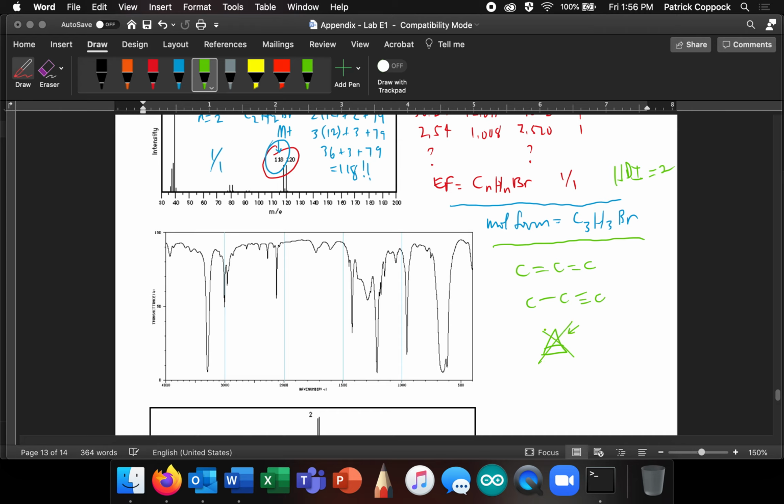So I'm not going to even consider that because you see that ring strain right there, so tight, and it makes it even worse that it's a double bond. Super unstable, bad, probably explosive, right? Because that ring strain, we just don't see that. So let's consider these 2 possibilities, and now the possibilities include. I admit I'm looking over for clues. You just caught myself looking over here for clues.